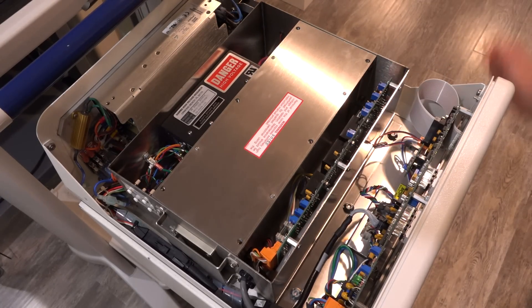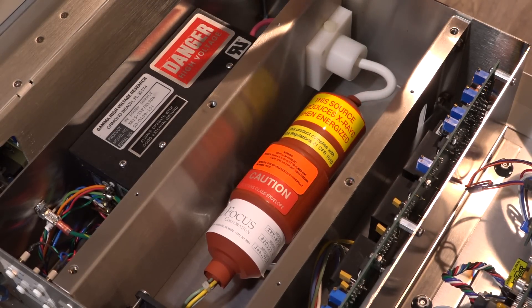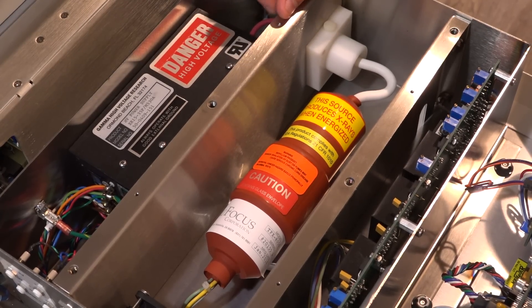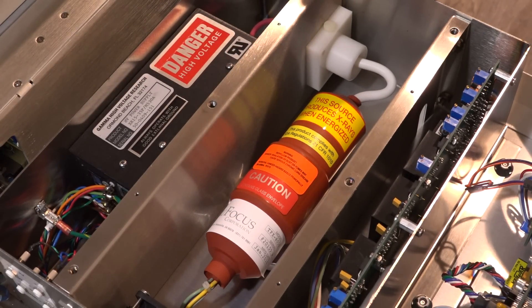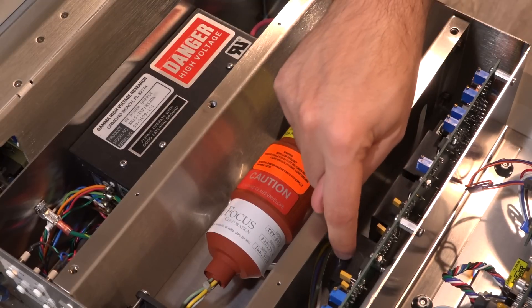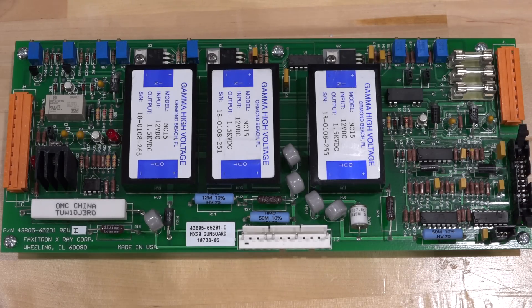With the safety screws removed, we can remove the top panel. Keep in mind everything is powered off and unplugged — really important when working on these. Here's our main tube looking really nice. There's a high-voltage input with a Teflon bracket through the metal piece to prevent arcing, as this can go up to 35 kilovolts. There are a few cables to control the tube: the filament and focusing lines must be coming from there, plus a fan to cool the tube.